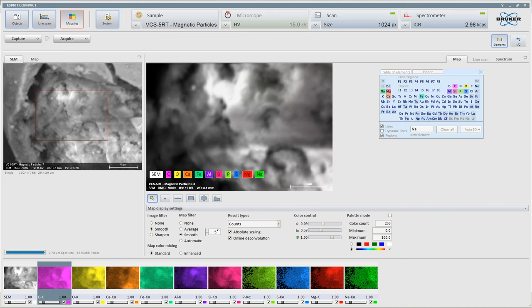Like, here we go, they've got some more up here. So, they're all over the place. Look at that sharp edge there. It's something fractured that's got a lattice kind of structure to it. Now that might have built up on the inside of, say, the copper pipe and then broke off.